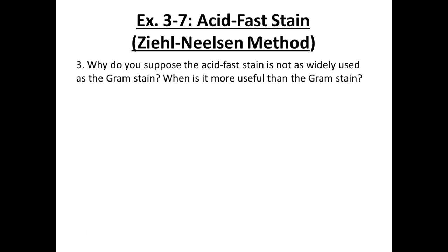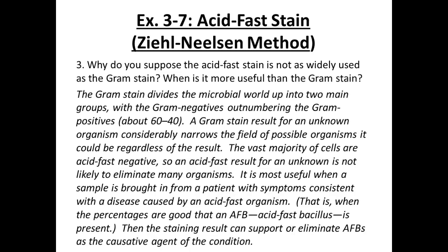You have the multitude of possibilities of different types of bacteria out there. With the gram stain, you're going to get positive or negative, and it basically narrows down your possibilities in half. About 60% of bacteria are gram negative, about 40% are gram positive. So that's the first stain, it's the most commonly used.